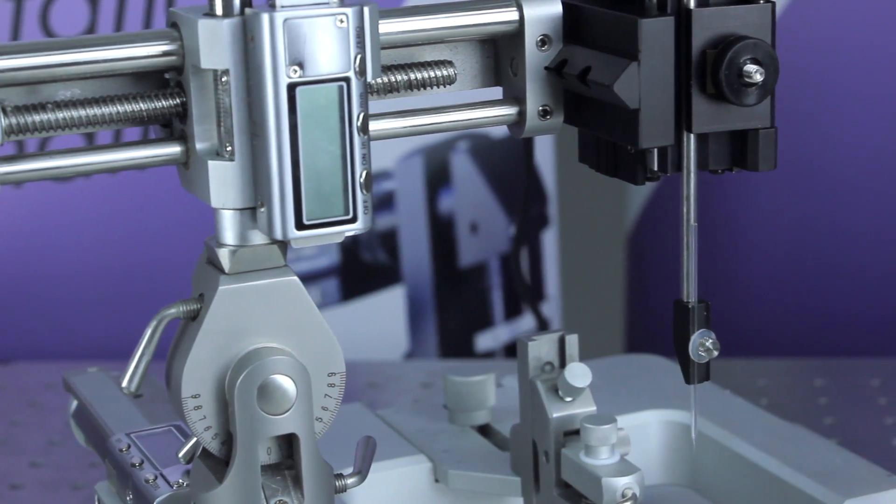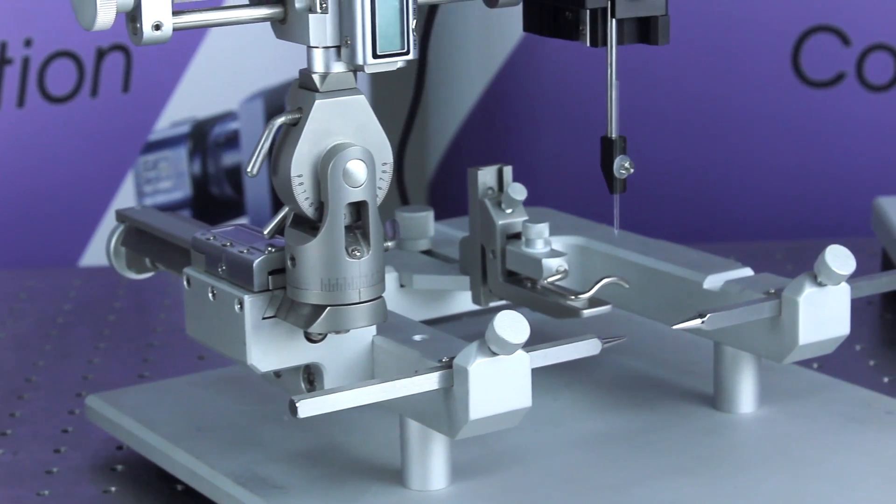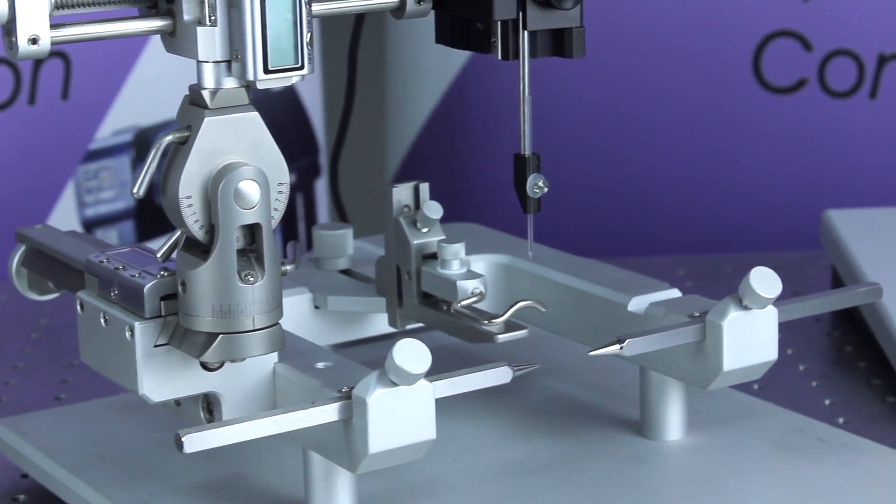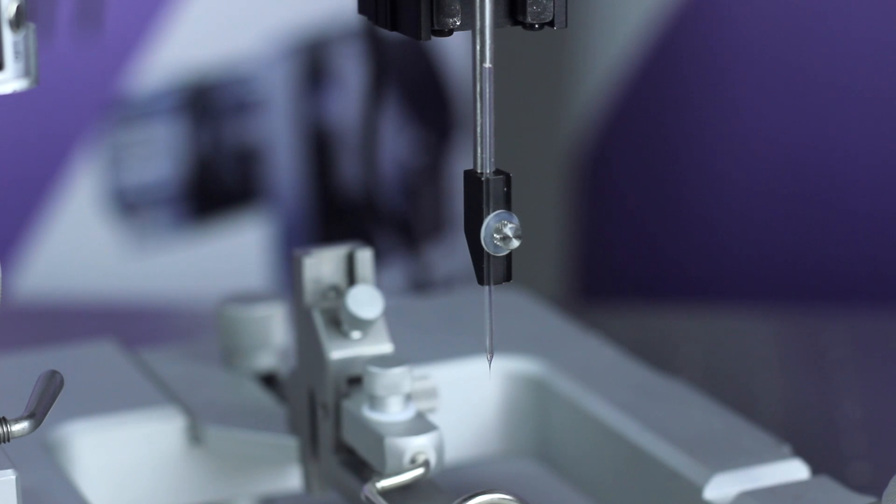The ultra stable manipulators have less than one micron of drift over two hours, enabling long-term experiments and preventing tissue damage. The 20 nanometer resolution means absolute positioning and super smooth movement through the sample.